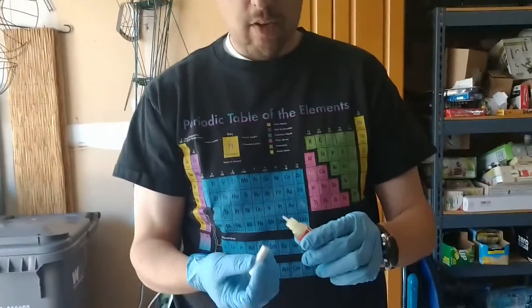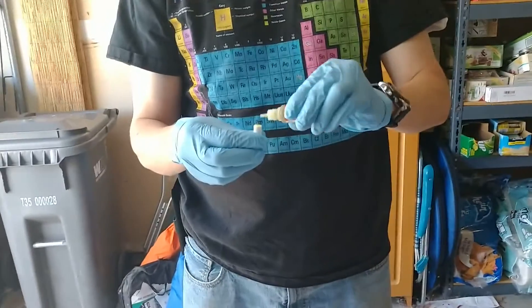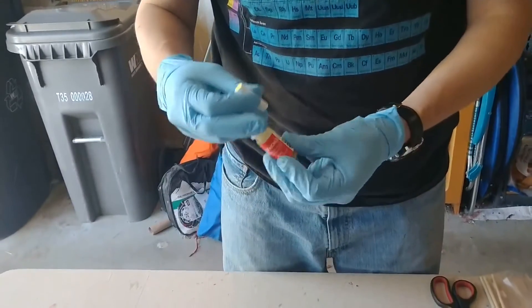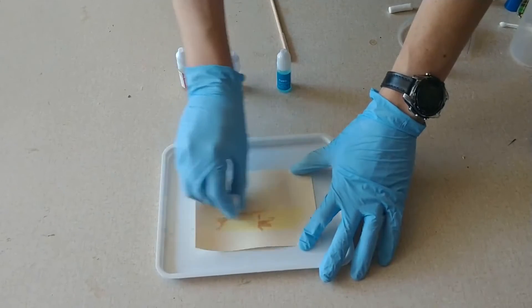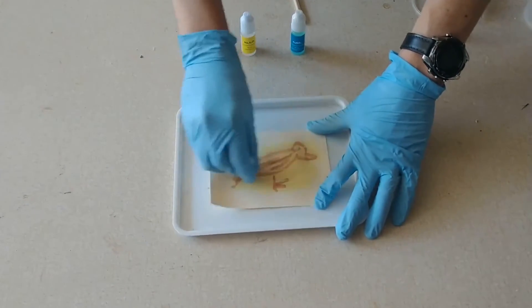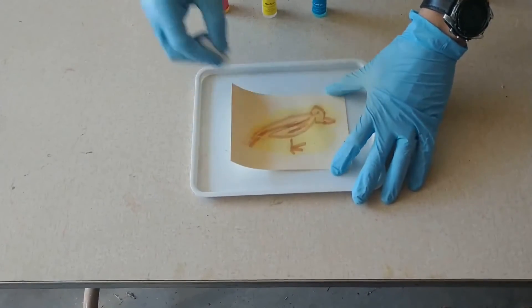Not to worry, we can actually make it come back. If we want to see the iodide come back, we just simply need another oxidizing agent. So I have here potassium ferricyanide — very bright yellow color on its own. But when I get that in here and begin to work back and forth, here comes our raven again. Only this time, instead of being purple, our raven is brown.